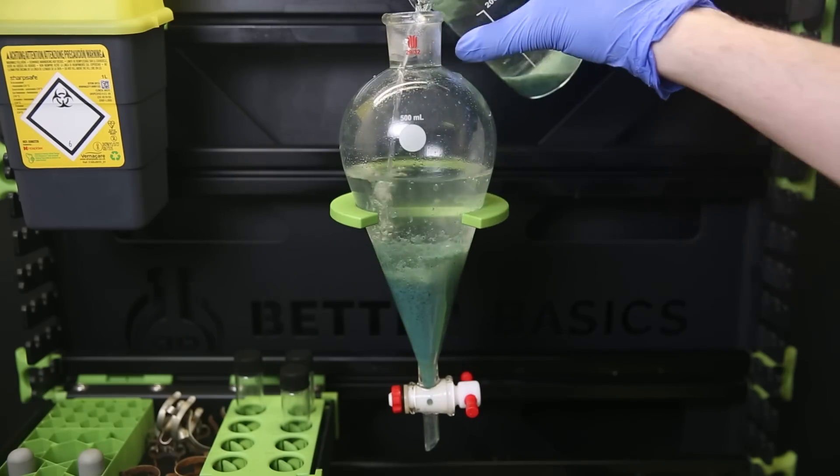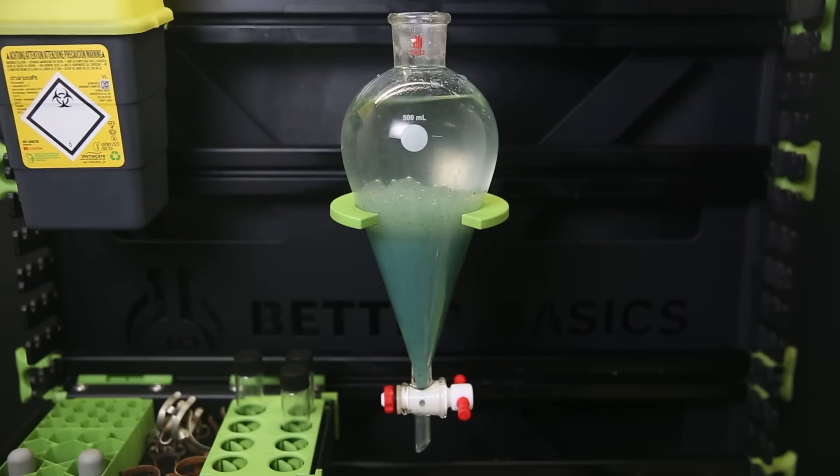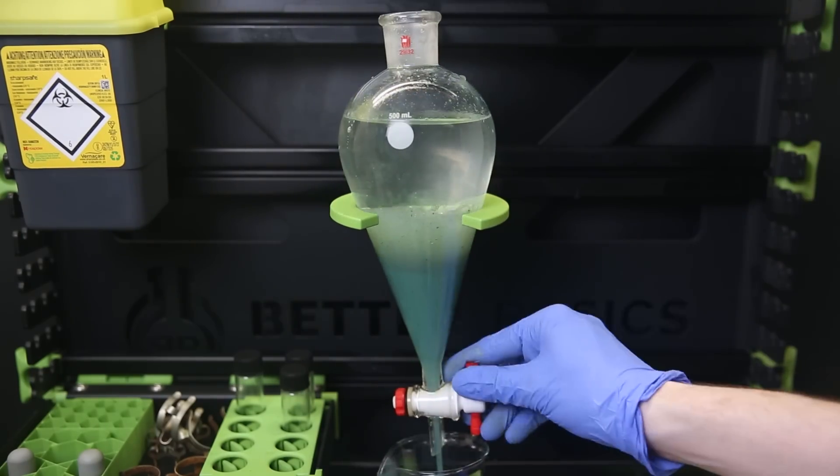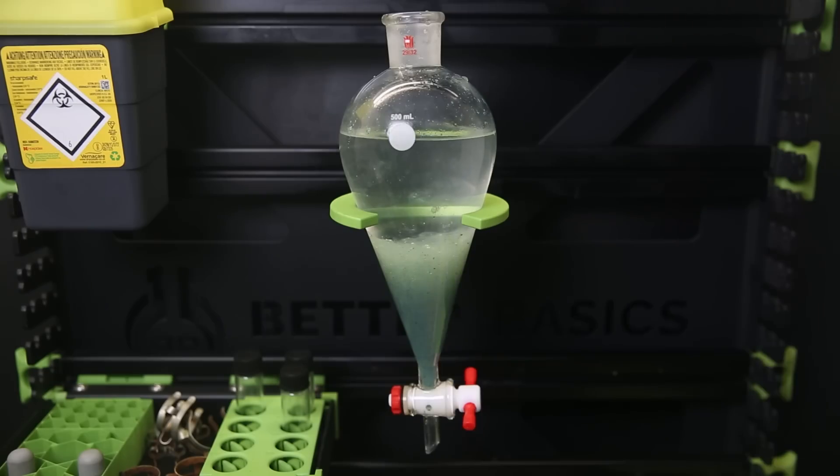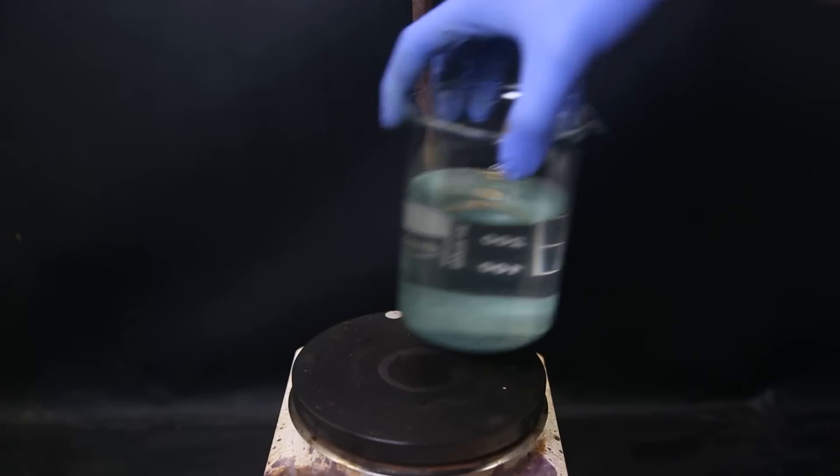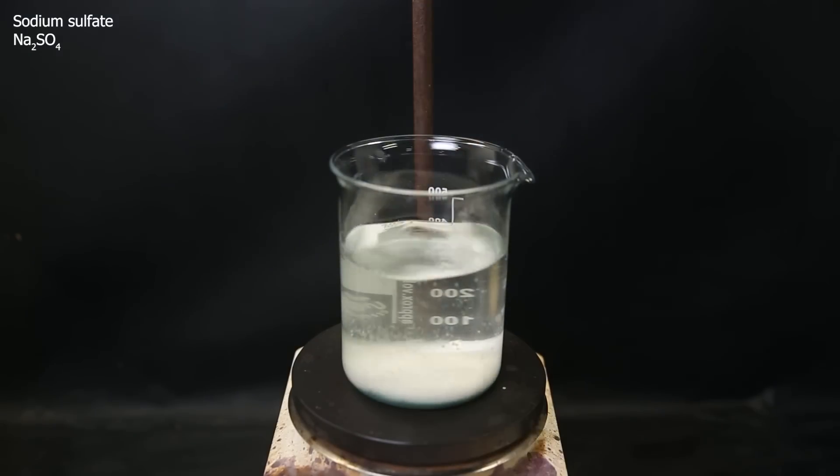I then move all the combined extracts to the separatory funnel, and the chromium junk that came along. I then wash it with water and a saturated salt water solution. A bunch of the chromium stuff still floats around, but it's not a problem. I just take the combined washed ether extracts and add a bunch of anhydrous sodium sulfate to it. This will hold all the water that came along, as well as the chromium junk in it.